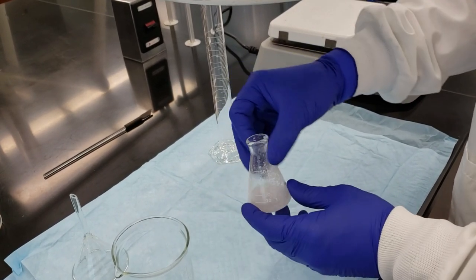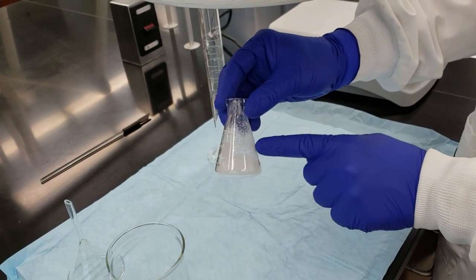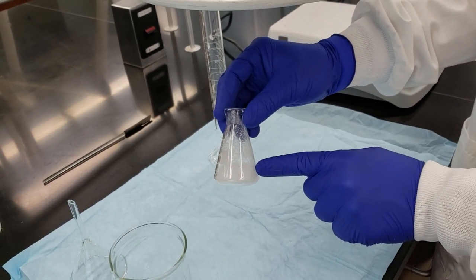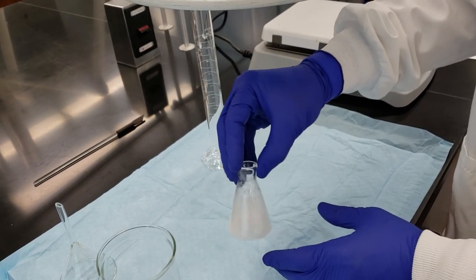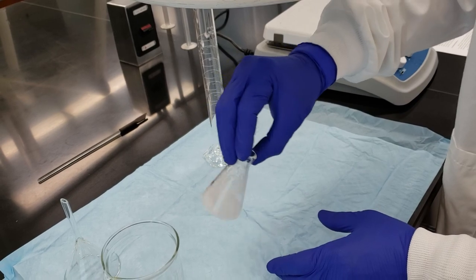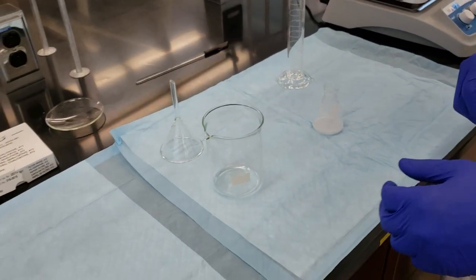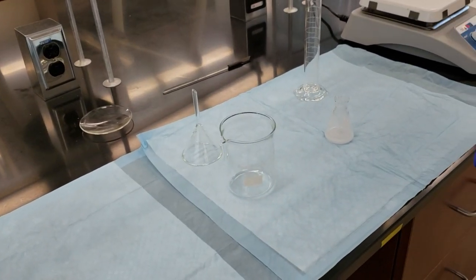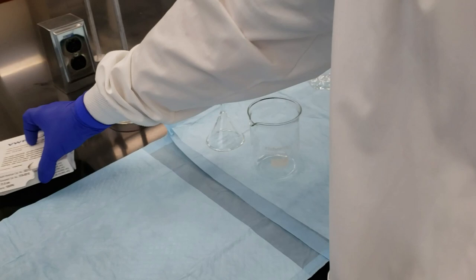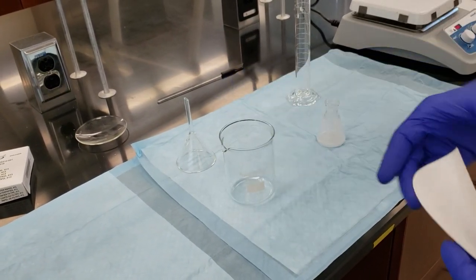Swirl this around, try and get as much of our aluminum oxide. If you can see, the aluminum oxide is stuck to the sides of our flask. Give that a good swirl. Let it sit for a second while we set up our gravity filtration. So we're going to do a gravity filtration, but we're not going to do it in an Erlenmeyer. We're actually going to do it over top of our 400 mil beaker.